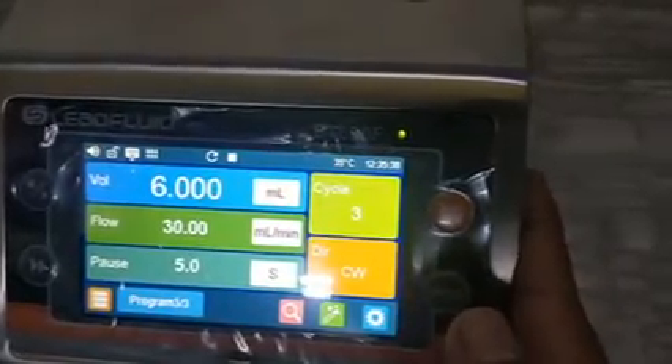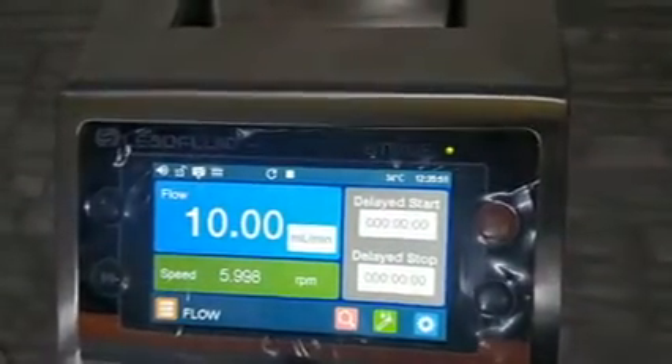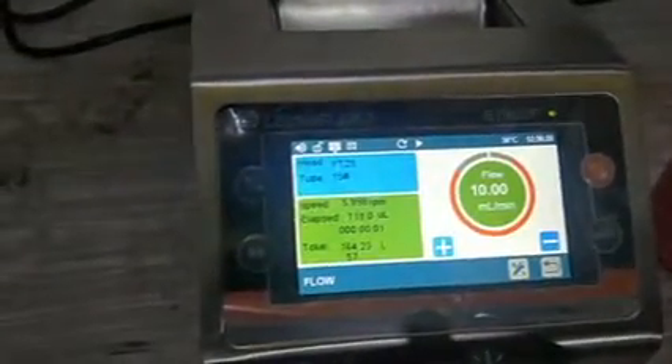One more thing: we can control the pump with a foot switch. For this, let me select Flow Mode at 10 mL/min. The foot switch has a D-type connector — the top part has 8 pins and the bottom has 7 pins, making a 15-pin connector. We keep the 8-pin part on top and connect it. When you press and release the foot switch, the pump starts.